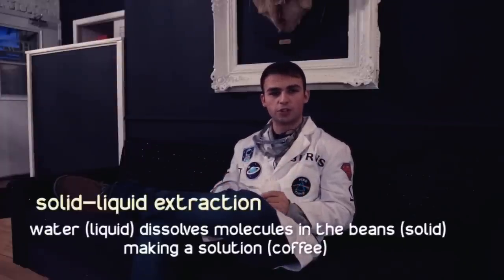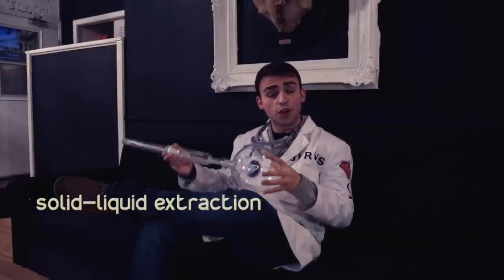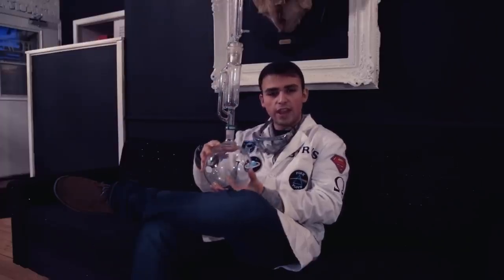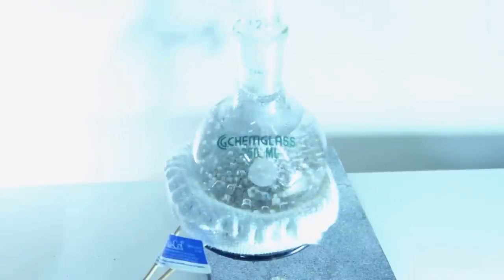The process of brewing coffee is what chemists refer to as a solid-liquid extraction. The apparatus we use to perform this is what's known as a Soxhlet extractor. Here's how it works. We filled this chamber up with ground coffee beans, and this flask below we filled with water, which was then heated up to boiling.